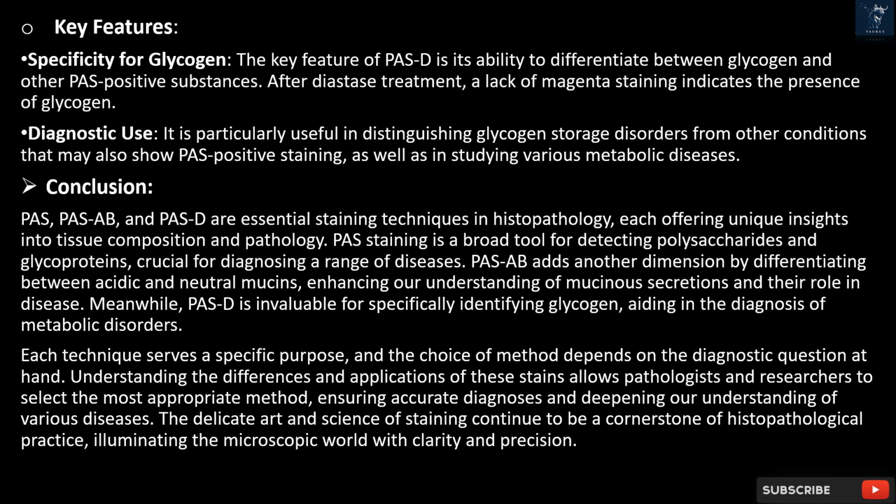Each technique serves a specific purpose, and the choice of method depends on the diagnostic question at hand. Understanding the differences and applications of these stains allows pathologists and researchers to select the most appropriate method, ensuring accurate diagnoses and deepening our understanding of various diseases. The delicate art and science of staining continue to be a cornerstone of histopathological practice, illuminating the microscopic world with clarity and precision.